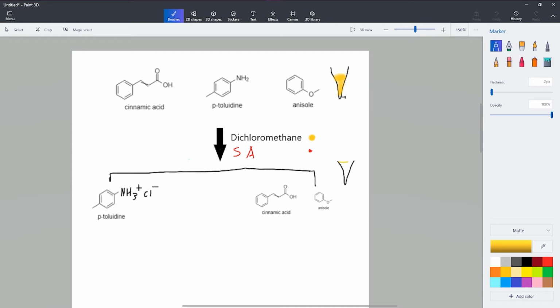What was our organic layer, which is the yellow on top, right? But now we have this aqueous layer with the acid at the bottom. So what we do is we pour this out by twisting this knob until we're left with just the organic layer again, leaving us with just these two compounds. Just these two. This is all we want.